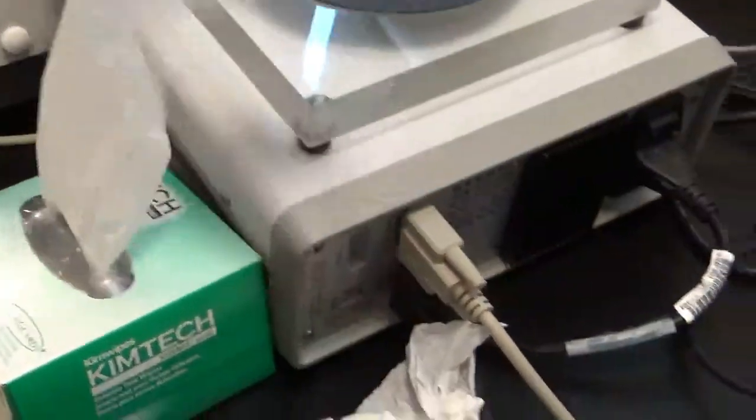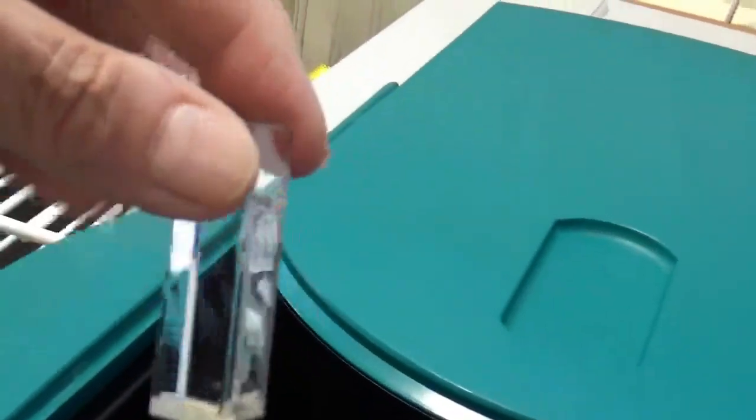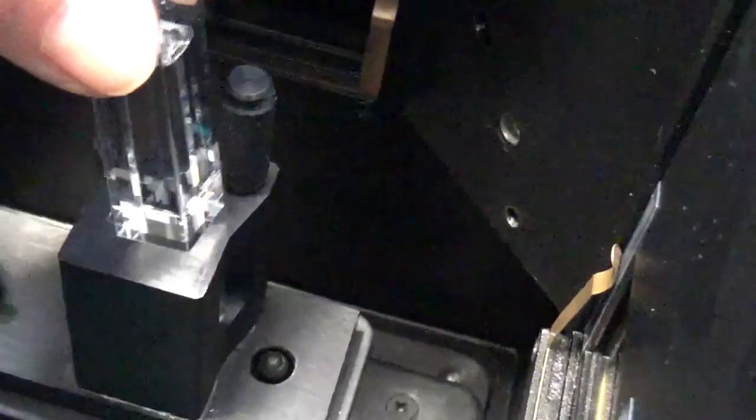I really should give this a nice wipe with some Kim wipes, which I have over here. So I'll just put the camera down and do that. Alright, so now it's all nice and Kim wiped. And now I'm just going to put it in the sample compartment over here.